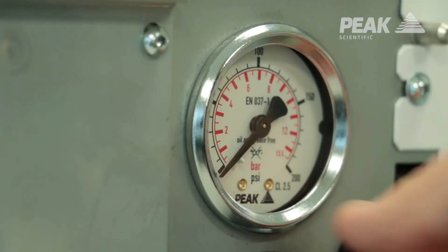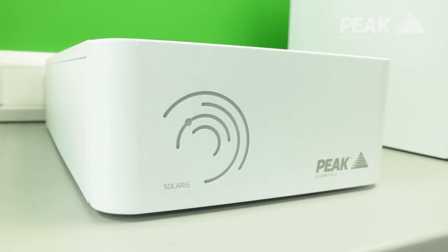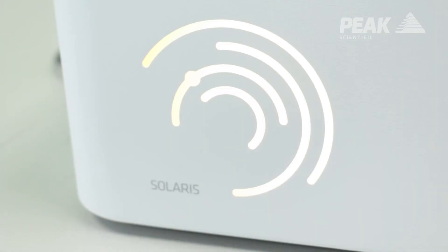Solaris XE has a pressure status awareness in the form of an LED light on the front within the cutout design. It will advise you when the generator is ready to use — the light will turn from amber to green — and also in the event of any pressure loss from the air supply, the light would change from green to amber to warn you that there was an issue.